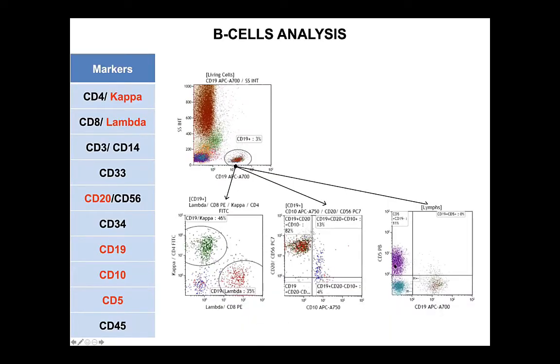For B cells, they are enumerated using CD19 and CD20, then the light chain is established using kappa and lambda. This is a normal bone marrow sample, and we can see the hematogones here represented by the dark blue events. We can also evaluate B cell maturation using CD10 versus CD20. The plasma cells are located in the lower left quadrant, CD10 and CD20 negative. An increased percentage of more than 2% will prompt additional investigation using the multiple myeloma tube.